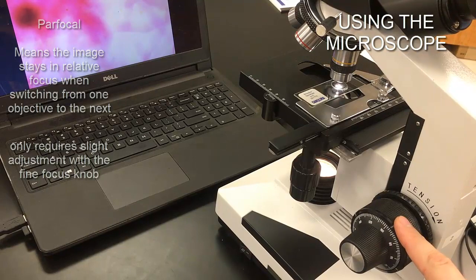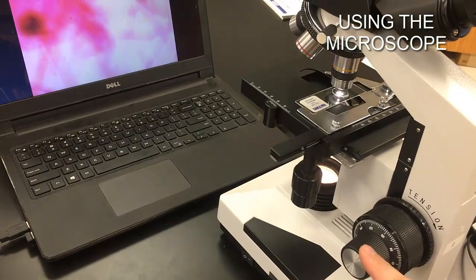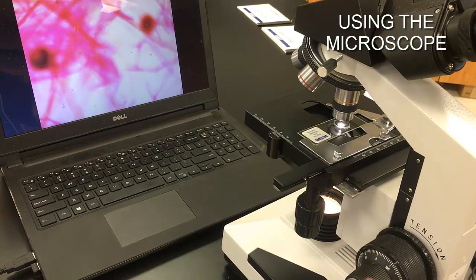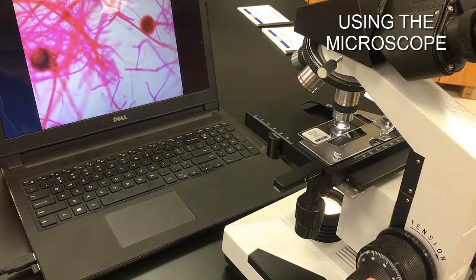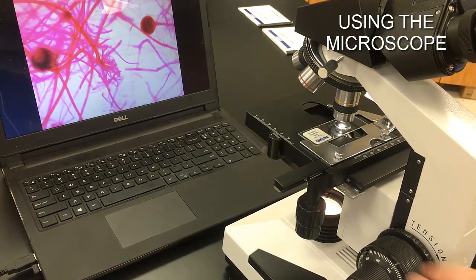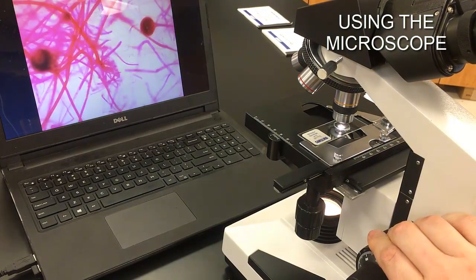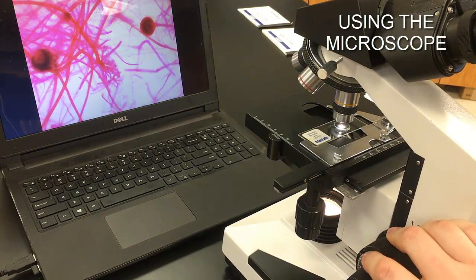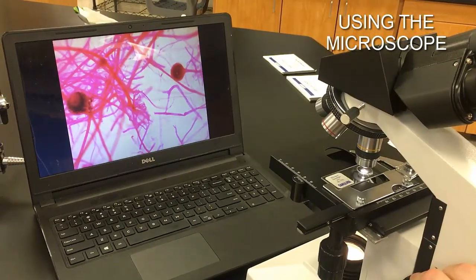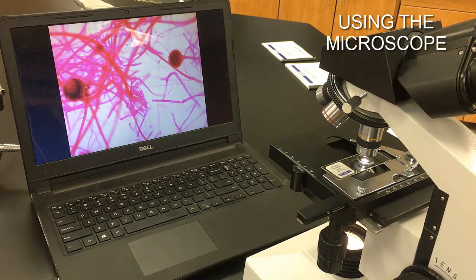The coarse knob gets us there with the 4x. Now at the 10x, use the fine knob — as I move it, the image comes back into focus. If you use the coarse knob at this point, you tend to go too fast and it's hard to fine tune. The coarse knob is really for rapid movement with the 4x objective only. Once focused, I can see the specimen at 100x total magnification instead of 40x — two and a half times bigger.